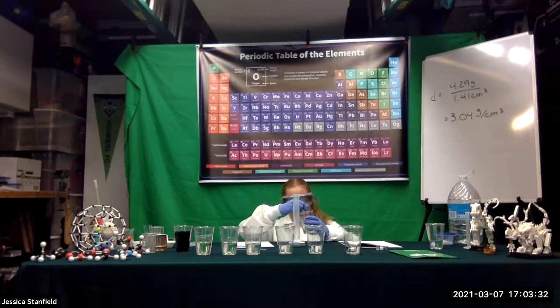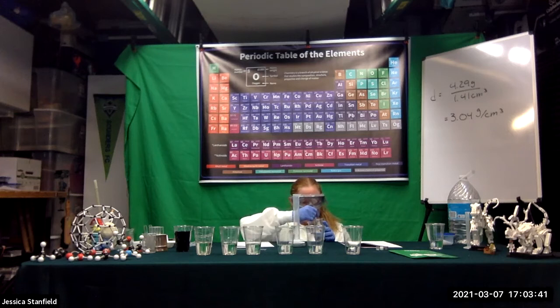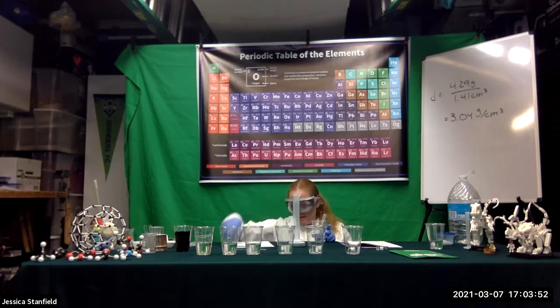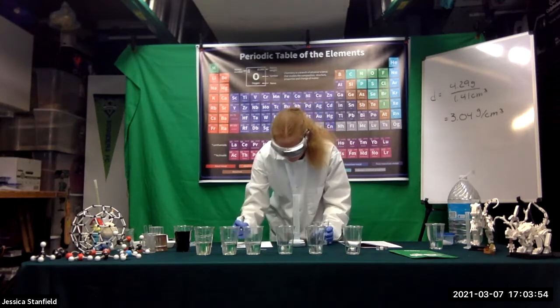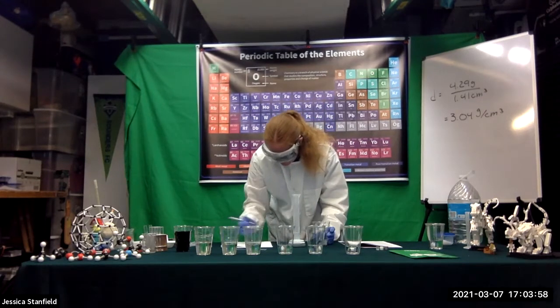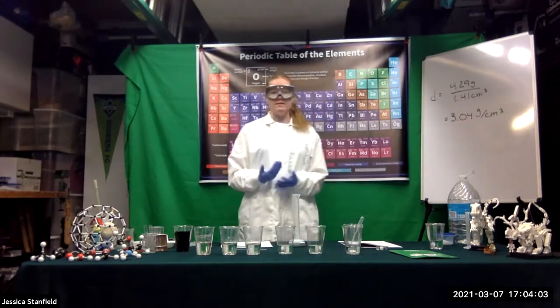Okay, now I'm going to do this again. I'm going to go from the 5 mil mark to the 10 mil. So I'm not going to pour anything out, I'm just going to add, because my next volume is 10 mils. I don't need to pour out and then add in 10 mils. I just have to add until I get to 10 mils. Okay. All right. And then I can read my mass. So I'm going to get 39.43. Okay. And I'm going to keep doing that until I've gotten to 25 milliliters of water.